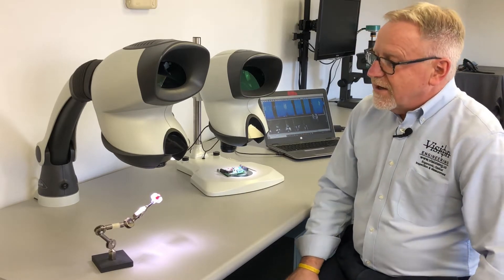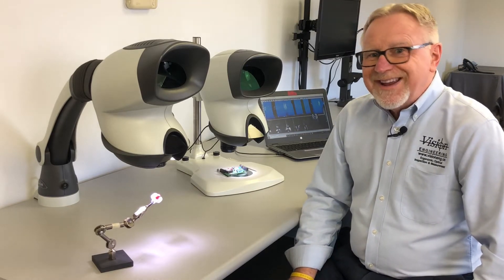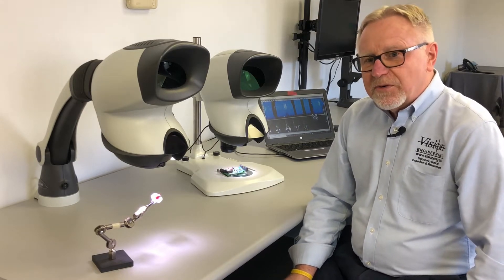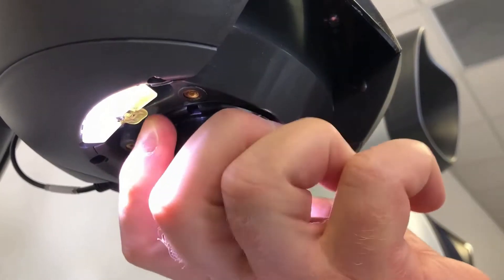The Mantis Compact is the baby of the family. It's a low-power viewer working with a range of two times to eight times. There are four individual lenses available in increments of two — so two, four, six, or eight times magnification. These lenses are easily changed on the fly.